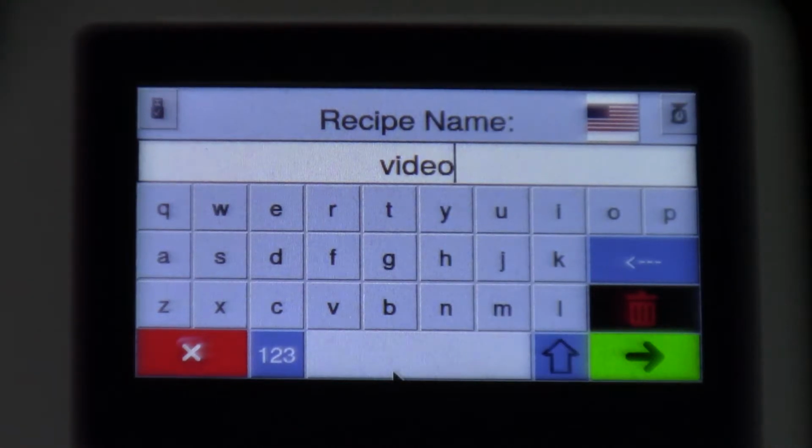Now, one thing I do want to bring to your attention is that if you have a keyboard established, please bear in mind the keyboard becomes your primary. So if you're on num lock, if you're on caps lock, the characters displayed will be that of whatever you're on. So don't be surprised if you're getting incorrect values when you're typing. Always refer back to your keyboard and confirm what's supposed to be there and what's not.